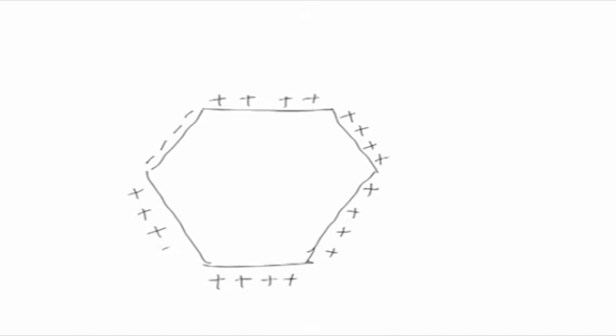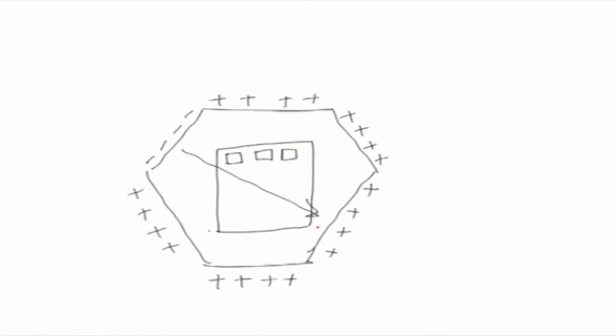So what you can do is, for the direction of force on the DNA, say there is a DNA molecule here, and a gel is placed in the center of this electrode array, and the samples are placed in here. Then they will move in this direction, and when you switch on another electrode in the second direction, from the center, this is plus 60 degrees, and there could be another arrangement in this direction.